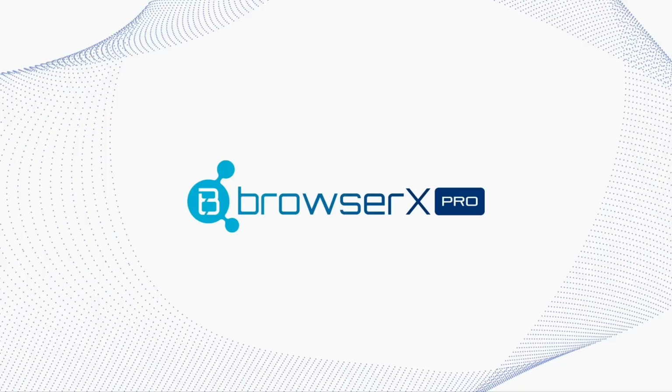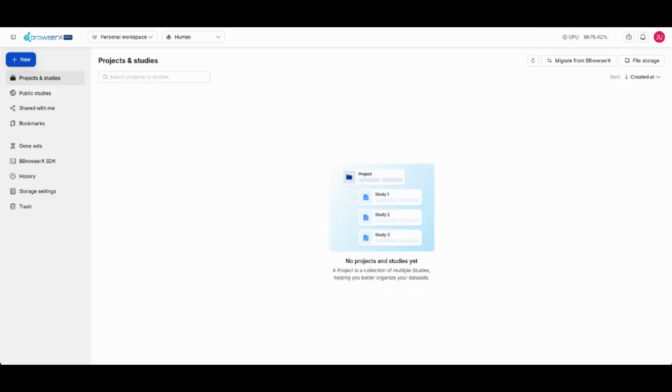So that presents an overview of our features. Now let's dive into the demo. When you first open BBrowserX Pro, you land on the Workspace. This is where you can work in your personal workspace or in group workspaces with your other colleagues.